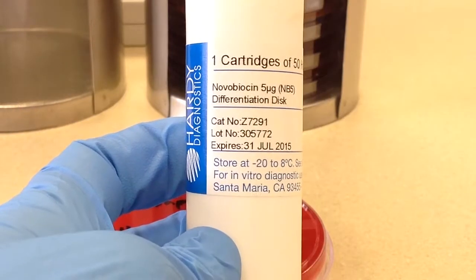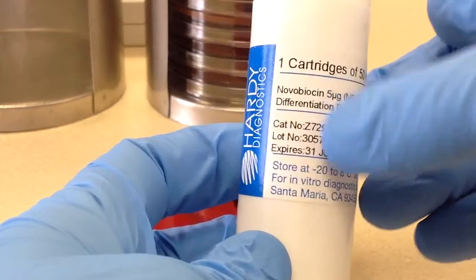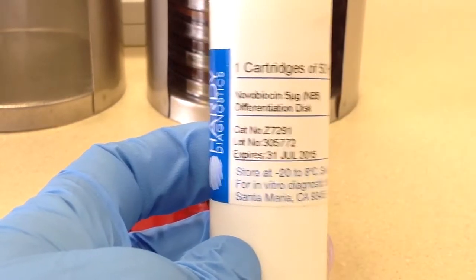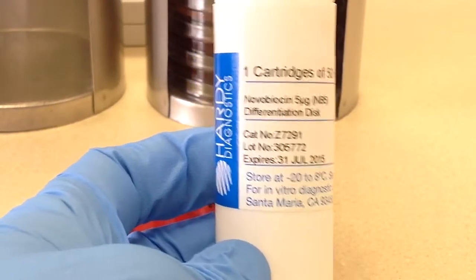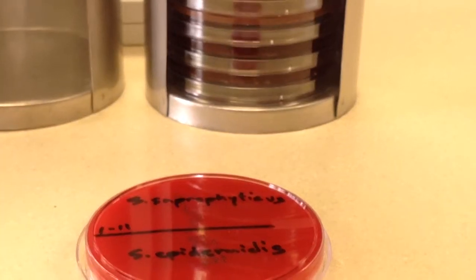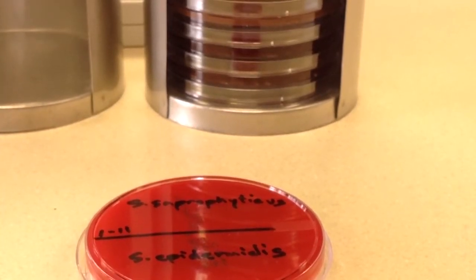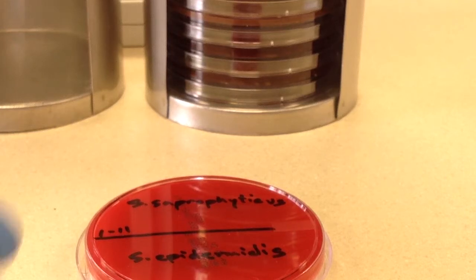we're going to do a novobiosin disc. And novobiosin is used to differentiate coagulase negative staphylococci. We're going to be using staph saprophyticus and staph epidermidis.